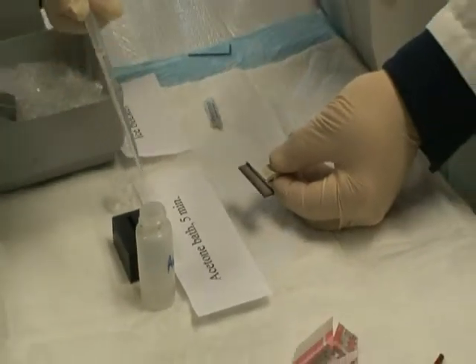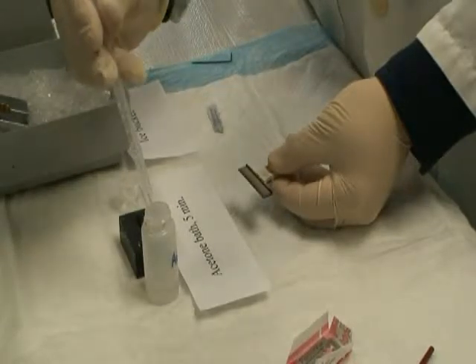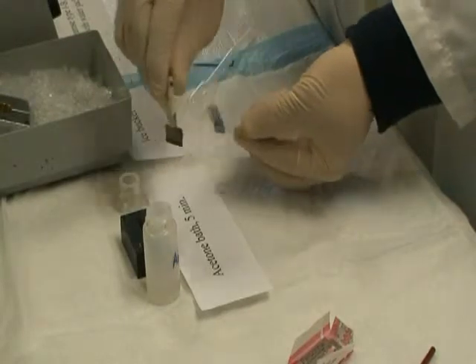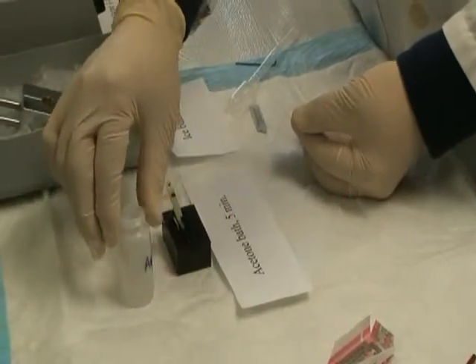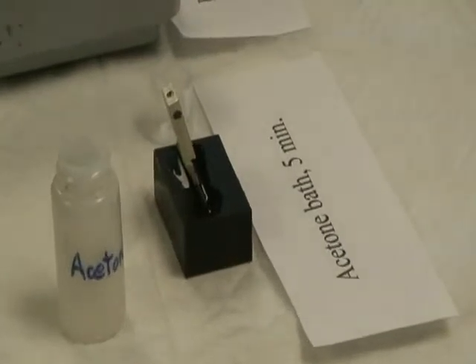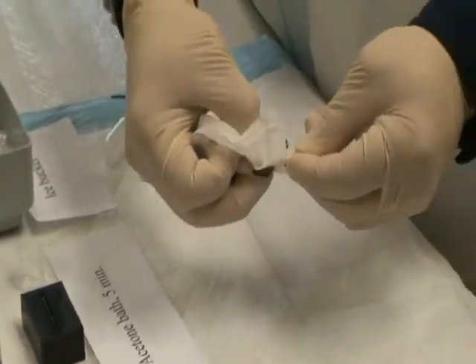Pipette 0.5 mL acetone to the acetone bath. Dip the blade holder into the acetone bath for 5 minutes. Clean up the glue residual with a tissue paper.